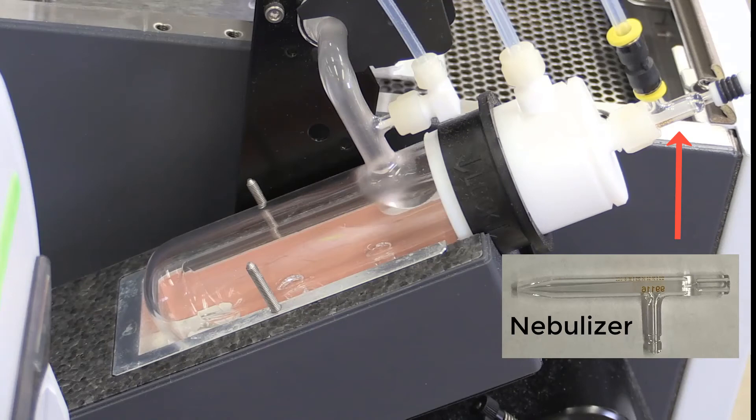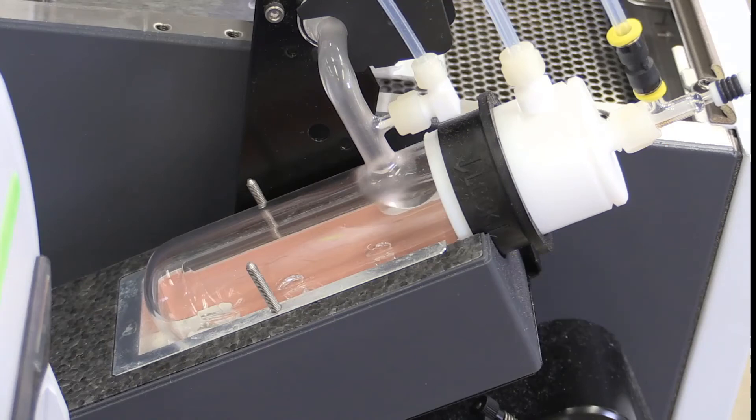The nebulizer converts the aqueous sample into an aerosol. This occurs when the sample is sprayed into a low-pressure region created by a high-speed gas. The sample is aerosolized as it mixes with the gas.